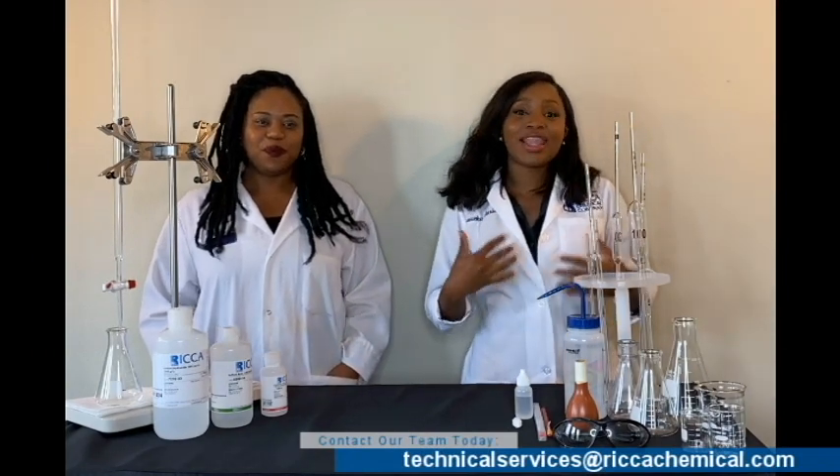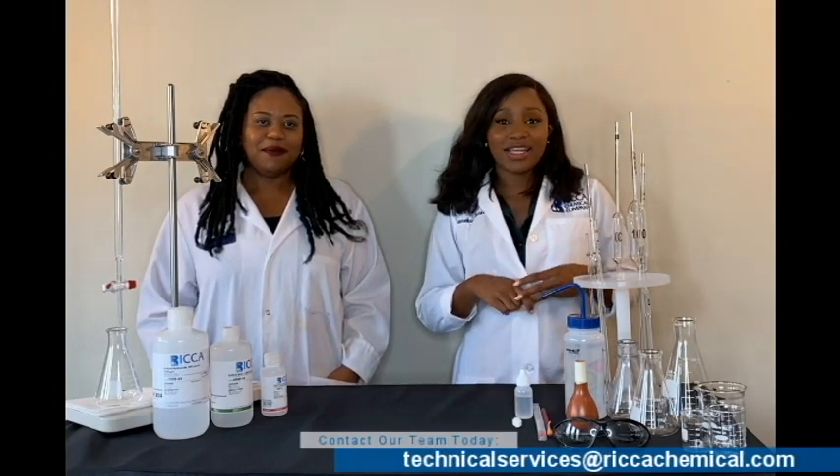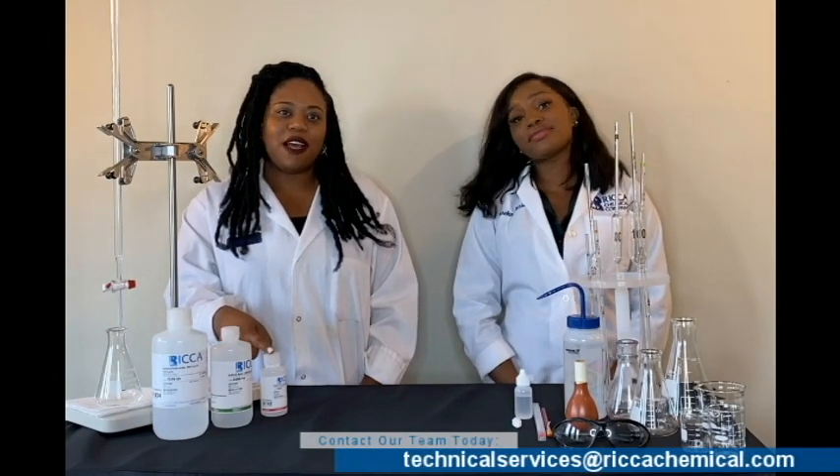In tech services, we get a lot of questions concerning our standards, reagents, and appropriate assays in order to execute both precision and accuracy. Today, we're going to do a titration with strong bases with standardized sulfuric acid solution. We're going to use 20 percent weight volume of sodium hydroxide, one normal sulfuric acid, and phenolphthalein 0.5 percent in alcohol as our indicator.